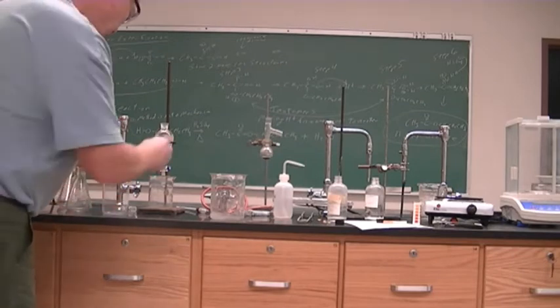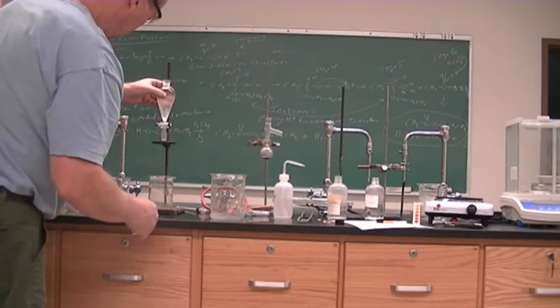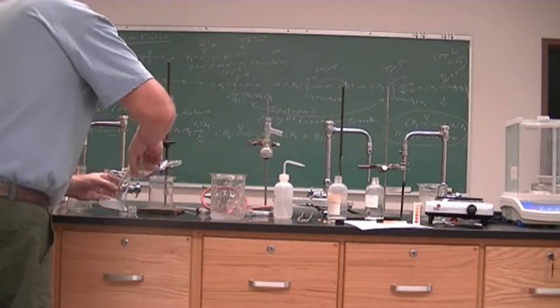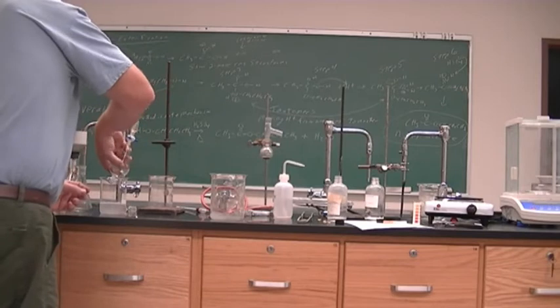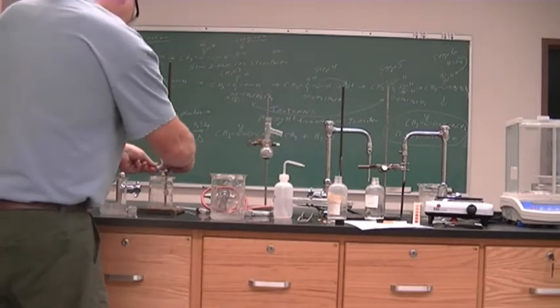Should have decanted that there. Solid in there this time.